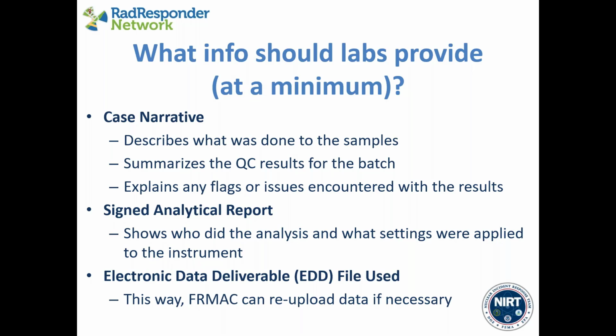In addition to the case narrative, we also ask for the signed analytical report. So this is typically something that is generated by a laboratory's information system, their LIMS, or through the vendor instrument software, such as a gamma spectroscopy report. And it's going to tell us things about the analysis, what sort of algorithm settings were chosen for the analysis, the peak analysis, what sort of radiochemistry might have been done. So it'll include some radiochemistry checklists, perhaps, with different weights and sizes of subsamples and whatnot.